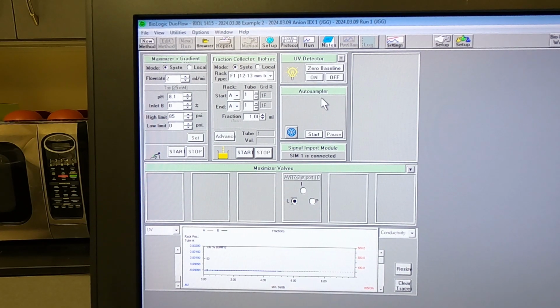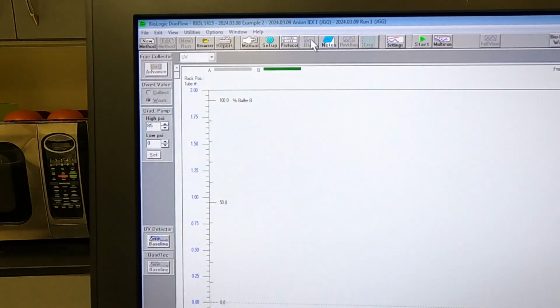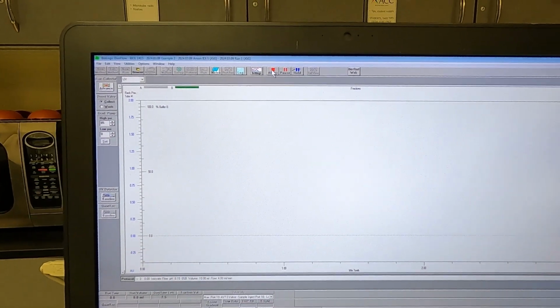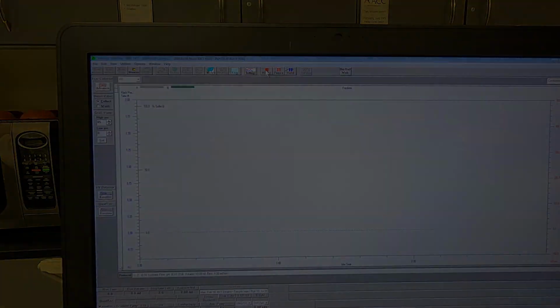Okay, so now we've got our sample loaded on the sample loop, and we'll return from the manual menu to the run menu here. All right, you see we get our green start button here. Now all we need to do is press start, and it will initialize, and purification will begin.